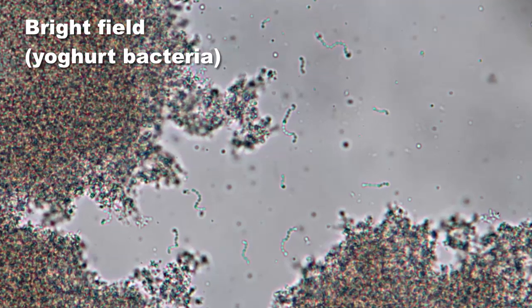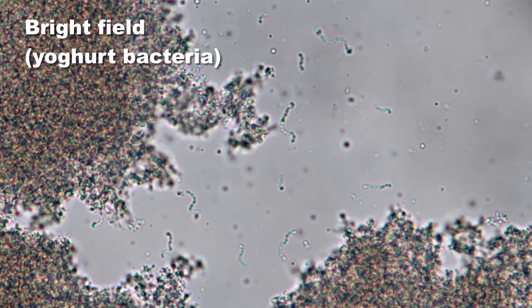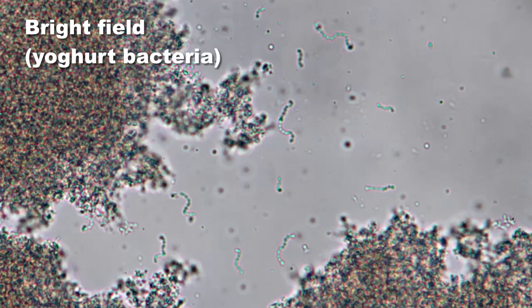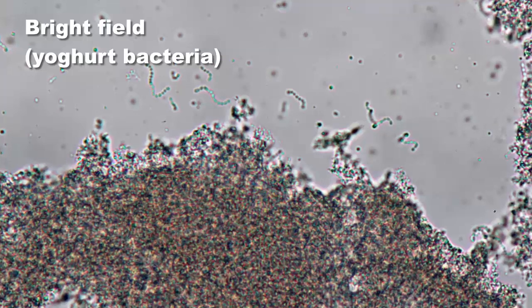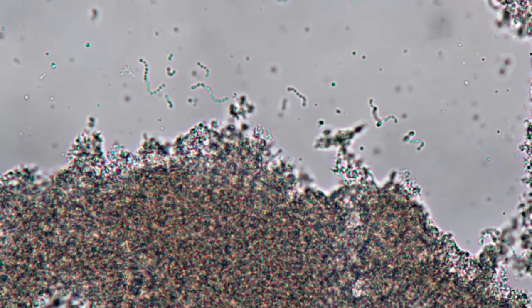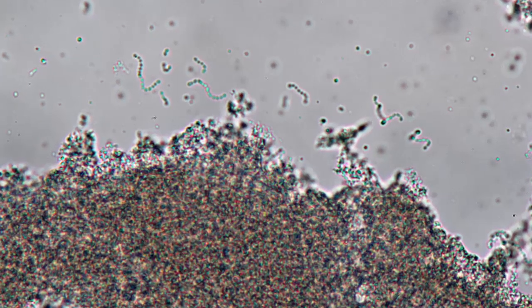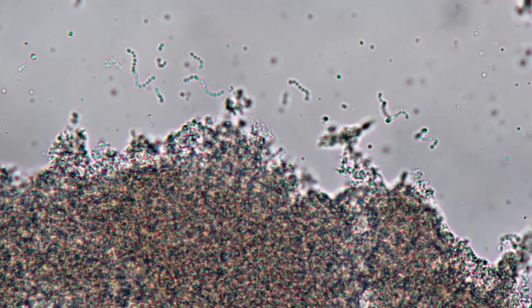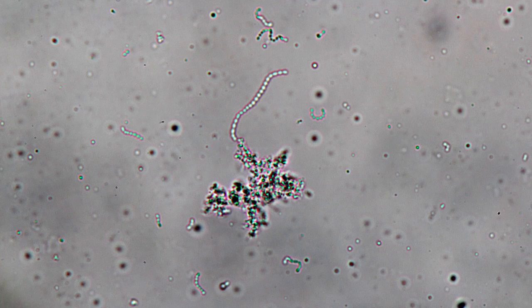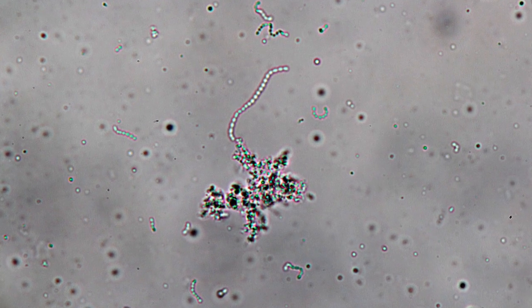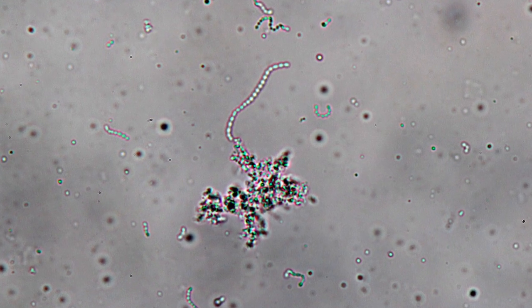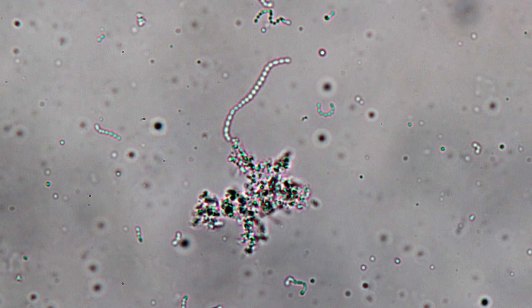And because these are cocci, which are round bacteria and as they divide, sometimes they tend to stick together and to form short chains. And if you see that, then they're actually easily identifiable as bacteria. Because otherwise, it's kind of difficult to distinguish the fat droplets of the yogurt from the bacteria. But if you actually see certain small chains of bacteria, chains of structures, then that's a strong indication that these could indeed be bacteria.